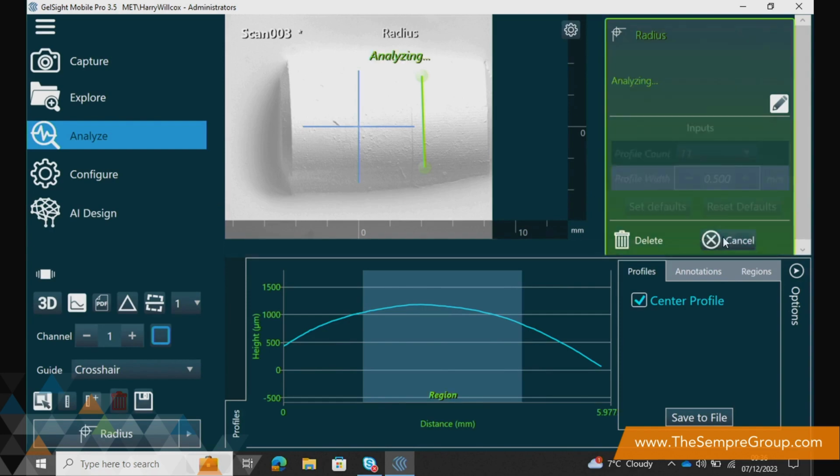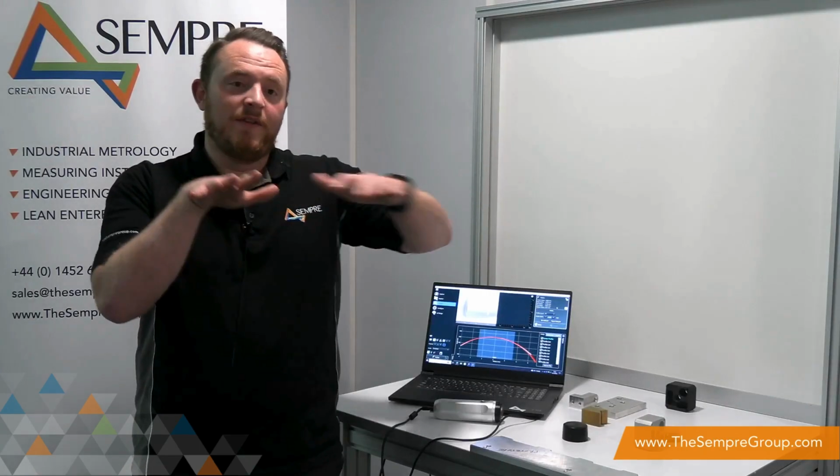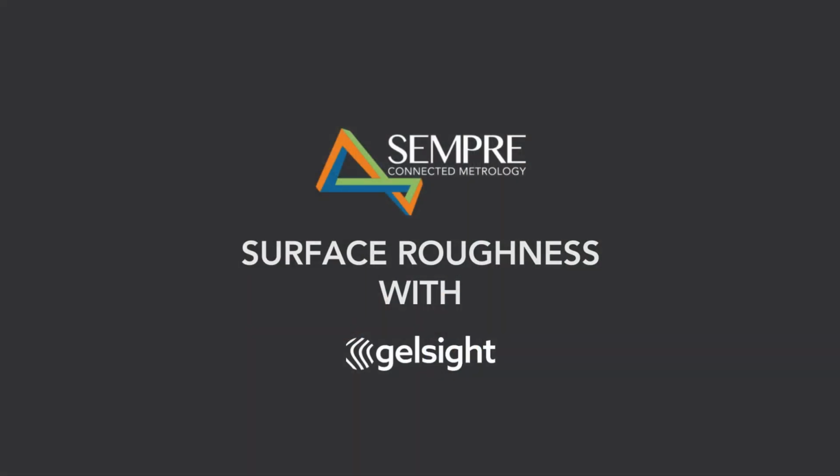and we click Analyze. Now what this has done is we're looking at the change of radius. So over a 0.5 millimeter area, we're looking at each individual radius, and we're outputting the worst case, or the minimum, the maximum and the median radius. So that gives us an understanding as to whether potentially the tool's wearing or there's a drift in the machine that's actually cutting the radius itself.